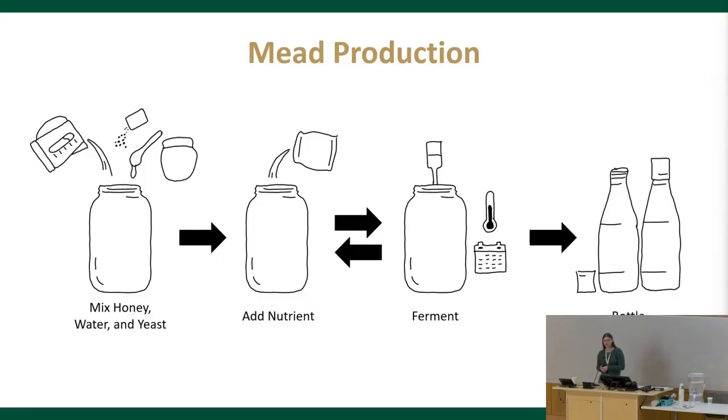In the experiment performed by our collaborators at Silverhand Meadery, 1-gallon batches of mead were made by blending honey with filtered water. They used 5 different dry yeast strains, which they rehydrated in filtered water for 20 minutes, and then they equilibrated the yeast to the mead by essentially putting little portions of the mead into the yeast. And then they pitched all of that back into the main gallon and allowed it to ferment. They did staggered nutrient additions on days 3, 5, and 7, and then they allowed it to ferment for a total of 9 months before filtering out all the yeast sediment and adding potassium sorbate and potassium metabisulfite as stabilizers.